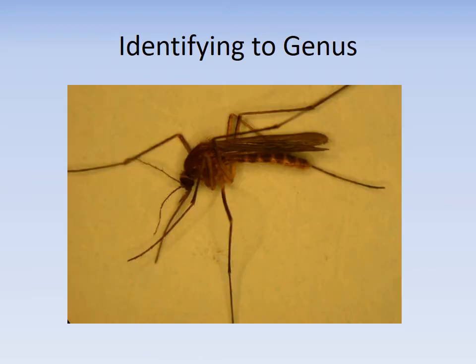So here's your specimen. If you know it already, that's great, but we're still going to go through this exercise and learn how to use the key. Now, if we were in person and going through this key, you'll stumble across some couplets asking, does it have this particular characteristic? Does it not have this characteristic? If you were to ask the biologists as they were walking around, some of us would be super stumped.